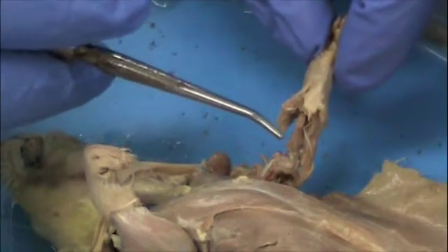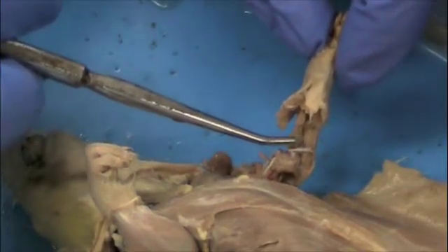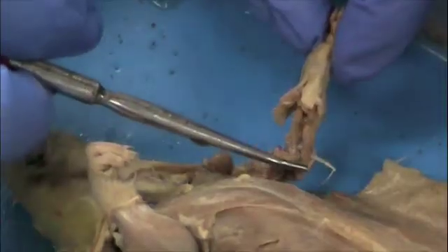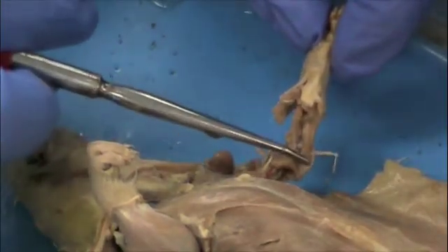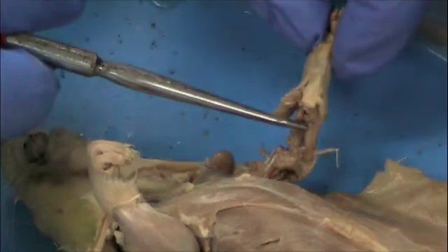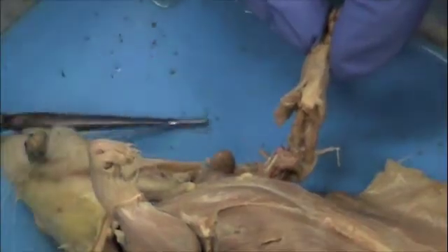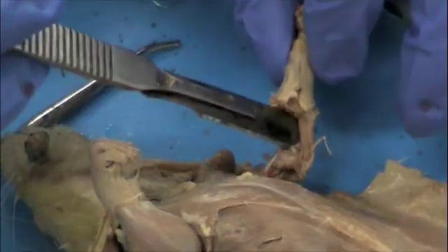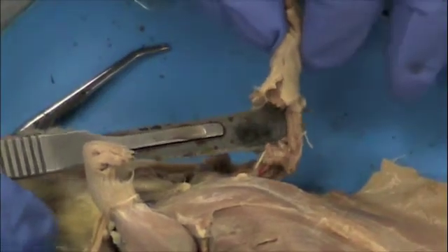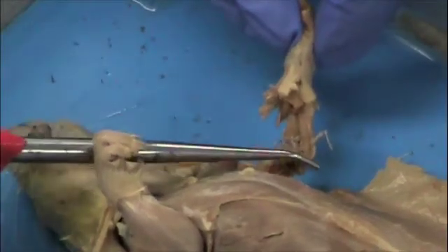Below the humerus are two bones that are very tightly spaced together — they are separate but sometimes appear as a single bone. The bottom one is the ulna. There are a couple of ways to distinguish the ulna from the radius: first, the ulna is a little bit longer than the radius and it extends to the elbow. Second, ulna starts with a U and the ulna is under the radius. On top of the ulna is the radius, which is slightly smaller. You can confirm they are separate by inserting your scalpel between them.